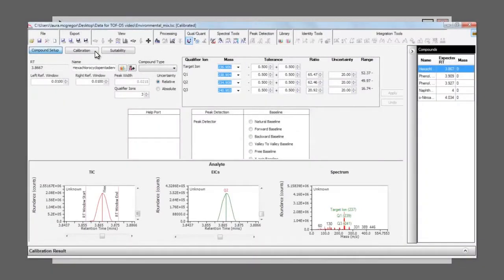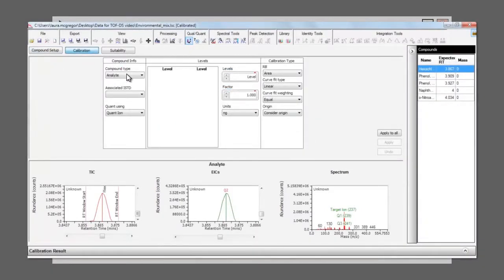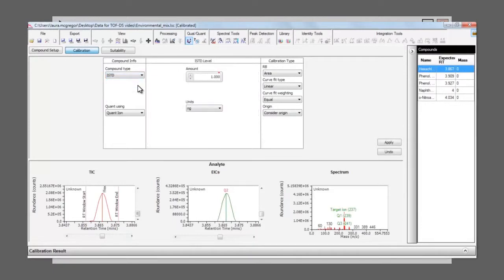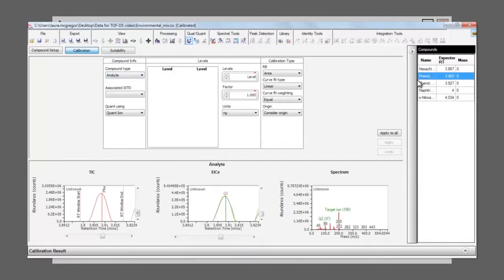The next step is to add the concentration levels. Defining one of these peaks as the internal standard makes it available in a drop-down menu for all the other compounds.